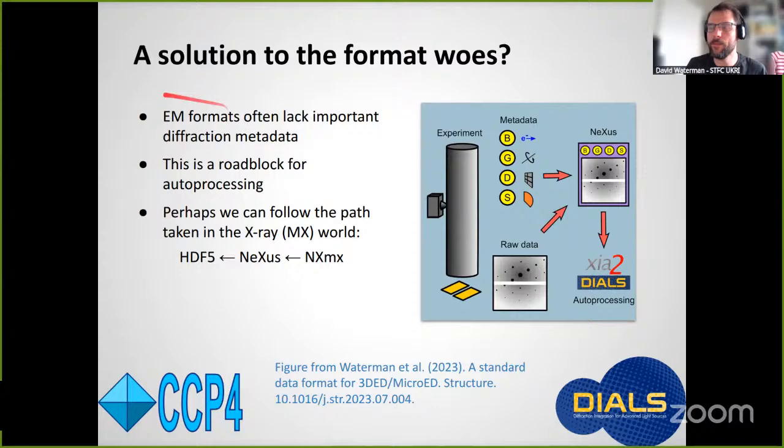So we mentioned the problems with EM formats. Really another issue is that the lack of a standard format containing full metadata is a roadblock for data auto-processing. But the users will very rightly demand this as data collection gets ever faster, and particularly as there are more and more automated data acquisition methods, like the Rays thing that was shown yesterday, and others that I've heard about. So pretty soon we're going to be awash with data, and we won't be able to process it unless we can keep track of the metadata properly.